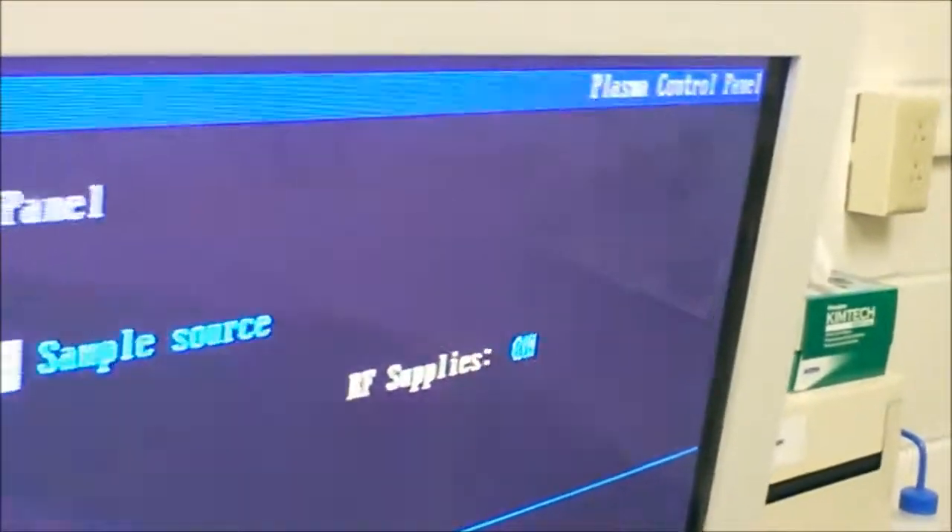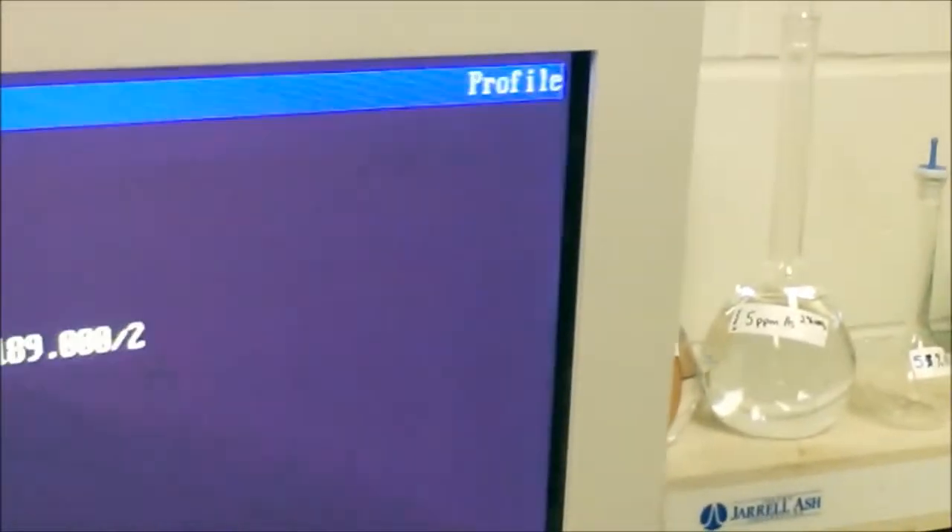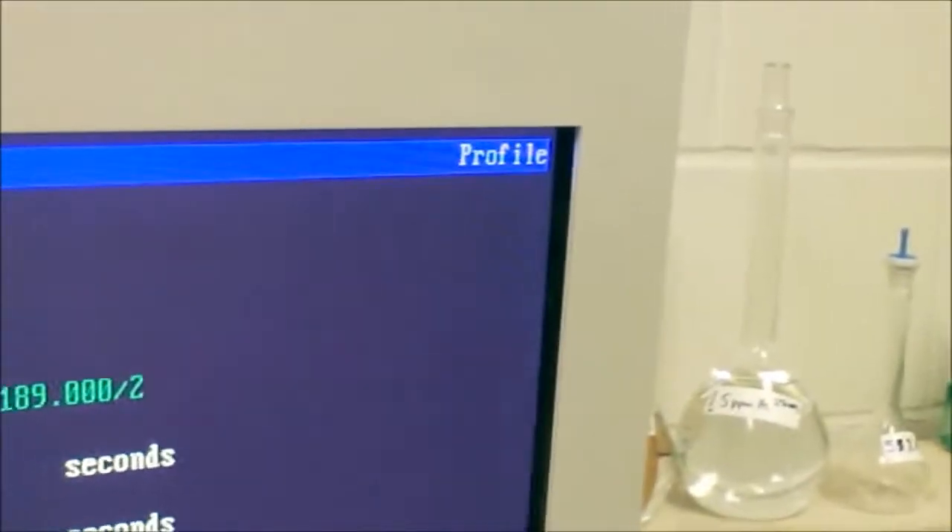Right now I'm just going to put in 5 ppm arsenic. You actually have to go in manually and start the pump sometimes, because it doesn't always like to start when you first start the machine. So now it's pumping — we're getting good nebulizer flow. We're going to take some 5 ppm arsenic solution. I've set up a flush time of 10 seconds. You go back to the entrance screen by pressing escape, then go to profile — which is right below plasma control panel, which is what we were in before. Then we go to automatic, F3, F1, put in 10, and then F1 run. And now we're running with a flush time of 10 seconds.